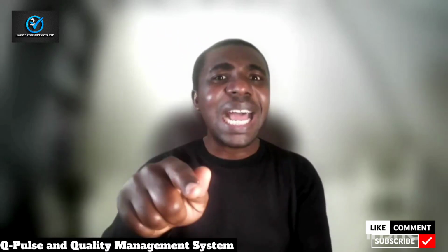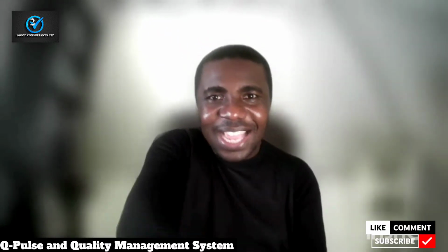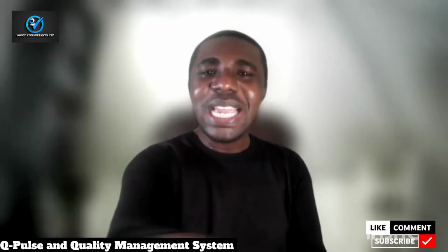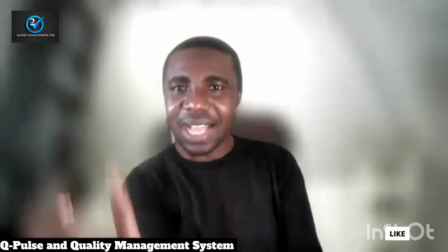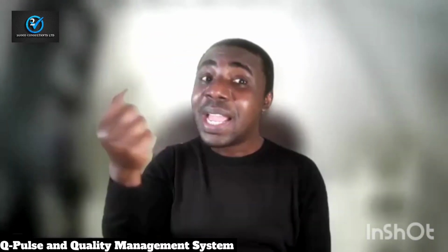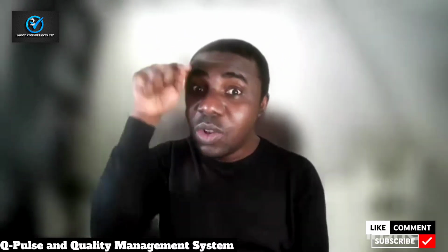The person on the counter is thinking only of whoever he or she is talking to. Are you getting it? But what you are looking at is how all the things going on at the counter reflect our accreditation. How is it maintaining the ISO standard? That is what a band 7 is looking at. That is what a senior member is looking at.